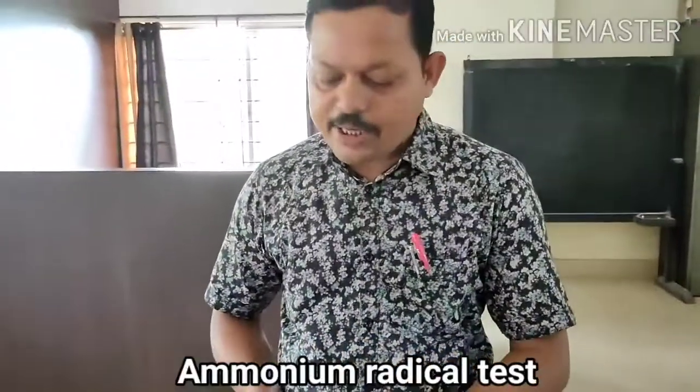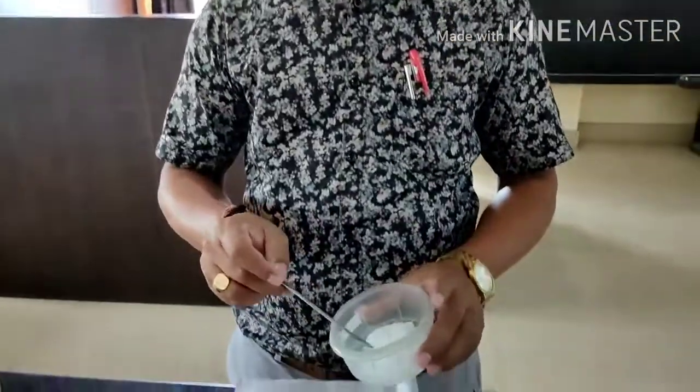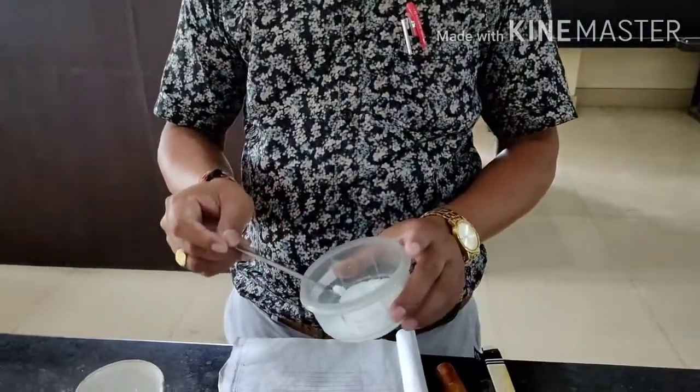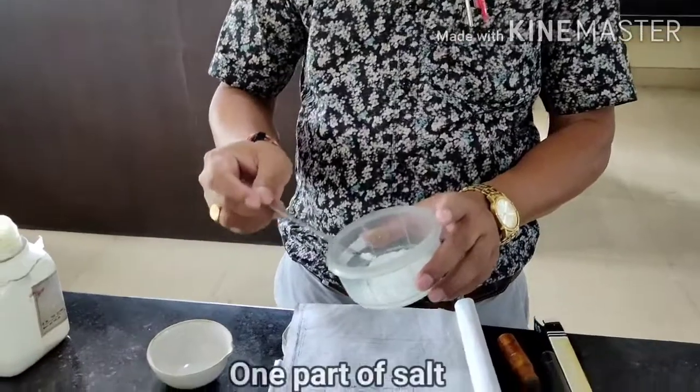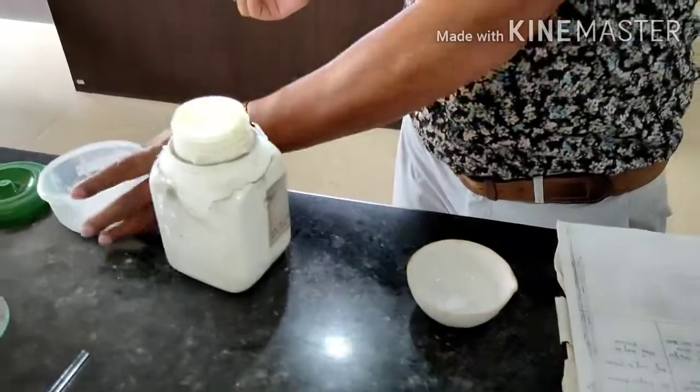This is about the borax bead test — this is the way you have to perform it. The last experiment is the ammonium radical test. This test is performed only when your salt contains ammonium ion. But you cannot directly say your salt contains ammonium ion, so whenever you get a white salt, you have to perform this test. To do the ammonium radical test, take the salt you have got — one part like this.